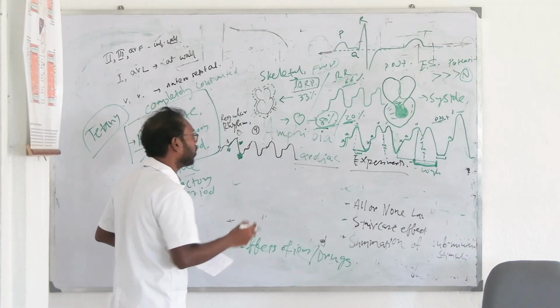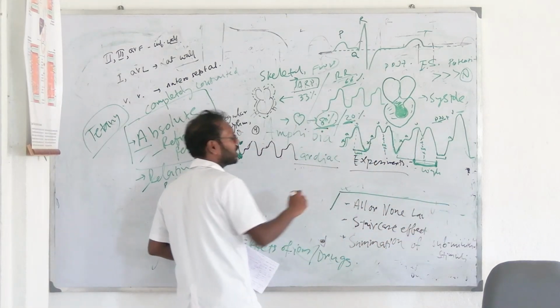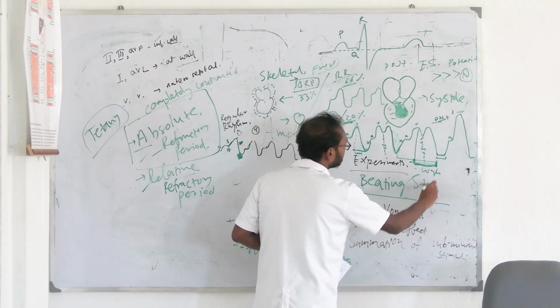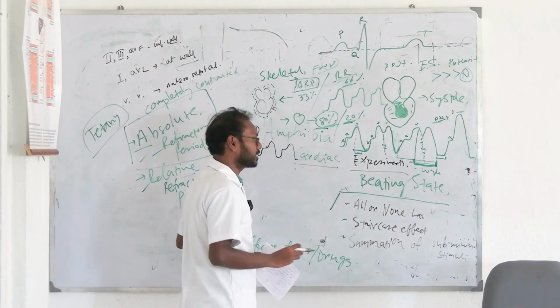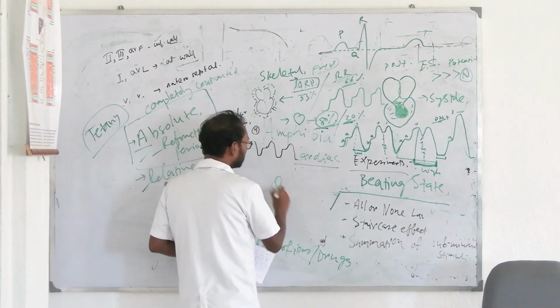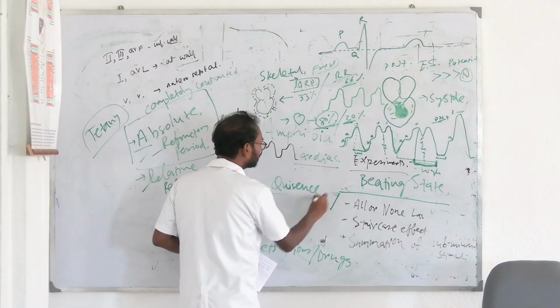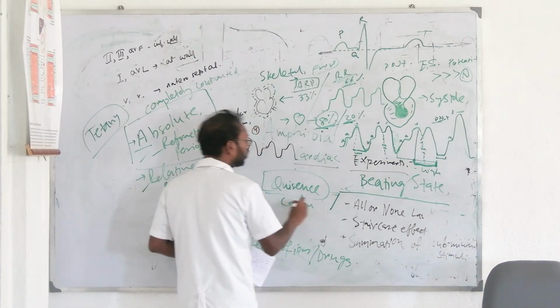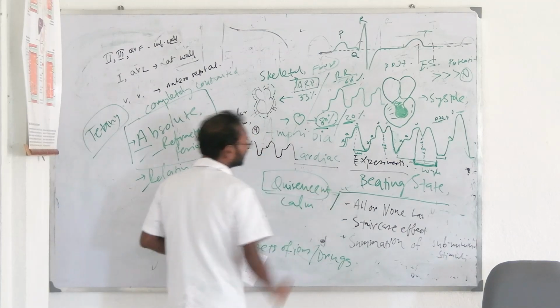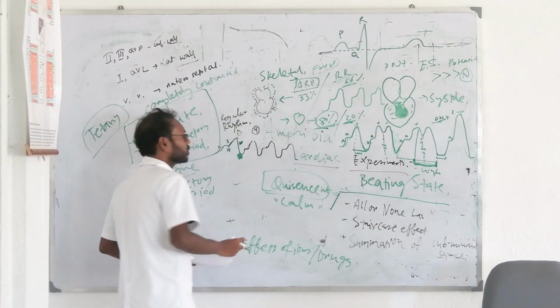Now in this case, until this time, we are taking and checking the heart in a beating state. Okay, beating state. The heart was beating continuously. From onwards, this will be quiescence, note it down. Quiescence means calm. Okay, the heart which is not beating, a quiescent heart. Check the spelling. Quiescent means calm. Okay, it's not beating. So all or none law.